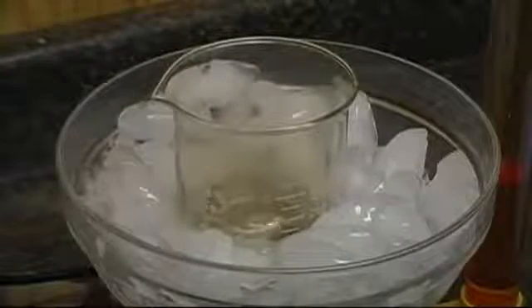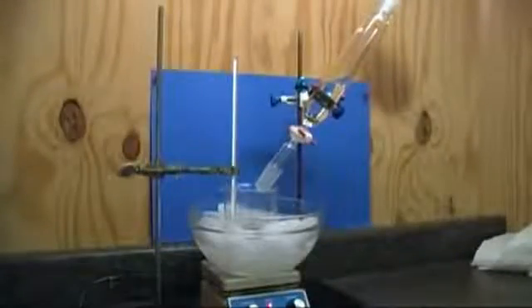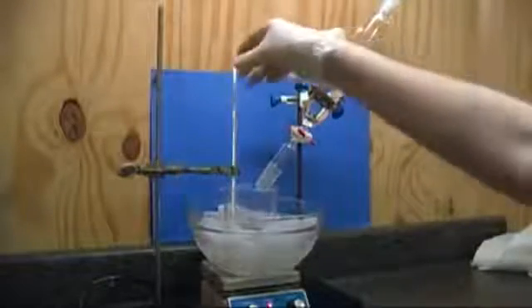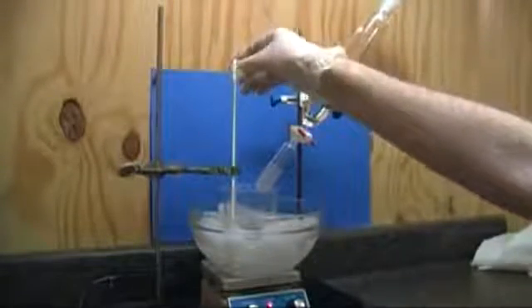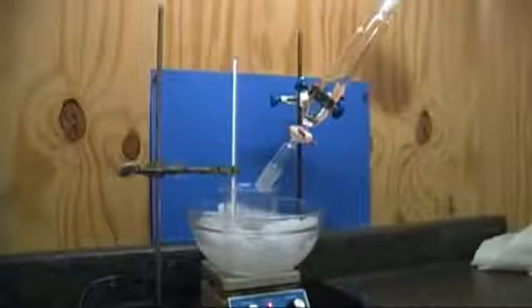The nitronium ion will act as our electrophile in our reaction. Once all the acids are mixed and have cooled down, you can begin to add the benzene. Place 60 milliliters of benzene in a sep funnel and set it up to begin dripping the benzene into the acid.